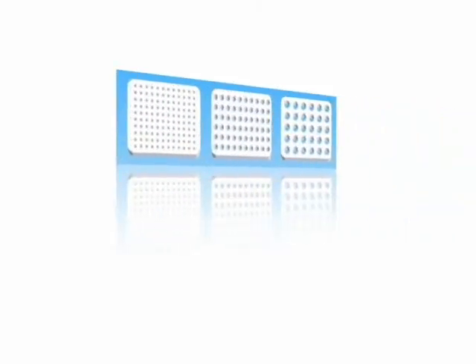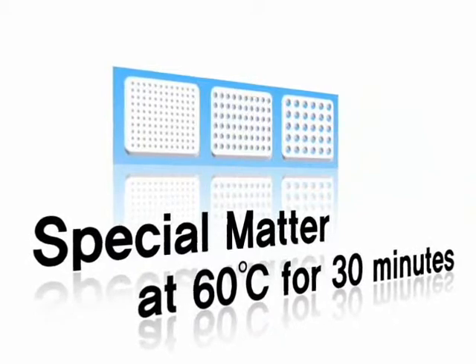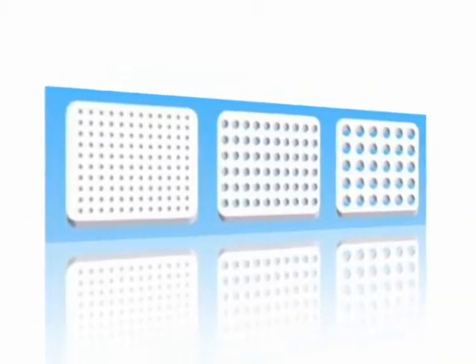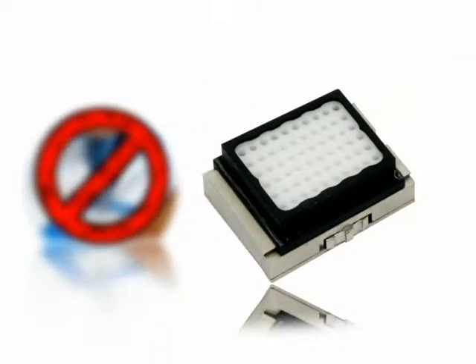The recipient block, a patented technology of Unitma, is made up of a special matter that melts if it is heated at 60 degrees Celsius for 30 minutes. Holes are evenly arranged in the rectangular block. It saves the time for making a current block and allows a researcher to maximize the efficiency of the TMA technique.